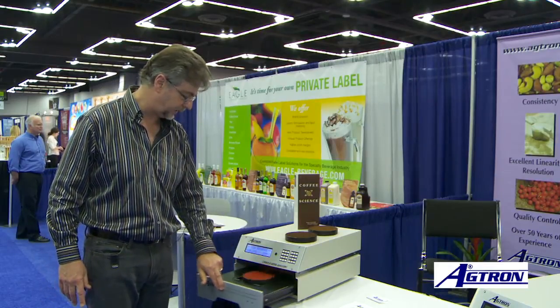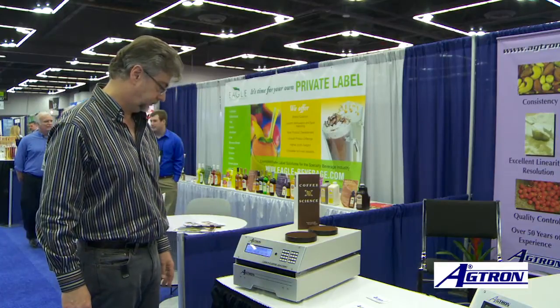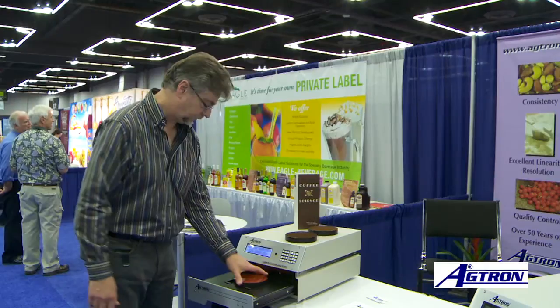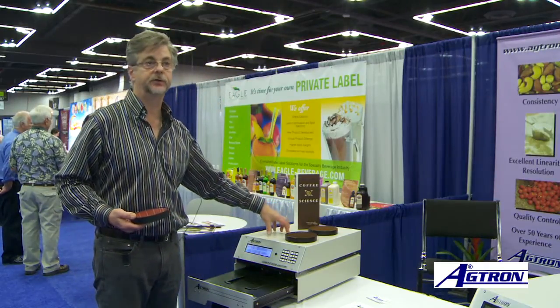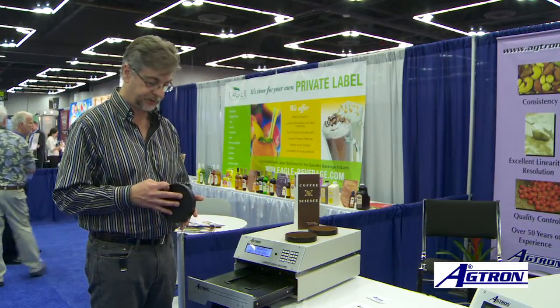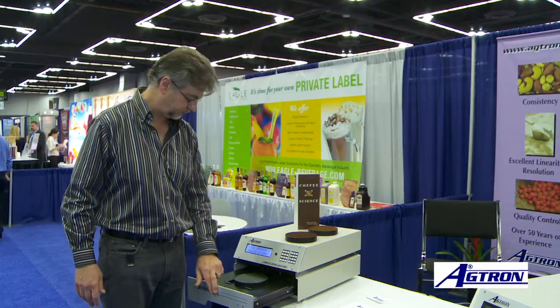We'll introduce that to the analyzer. When I open the drawer this time, the analyzer is looking at another disc that's under the drawer, and it's going to store that reference for future calibration. So I do this, say, at the beginning of a shift or the beginning of the day.